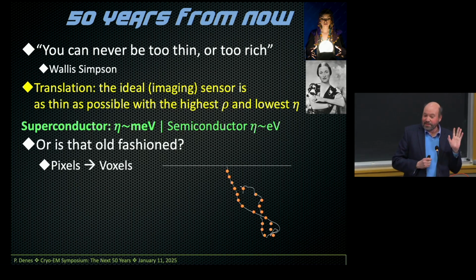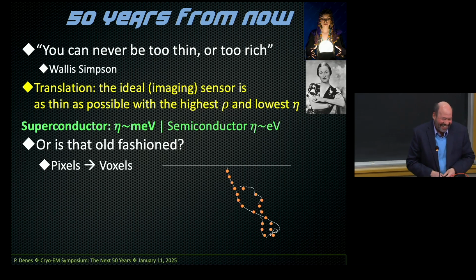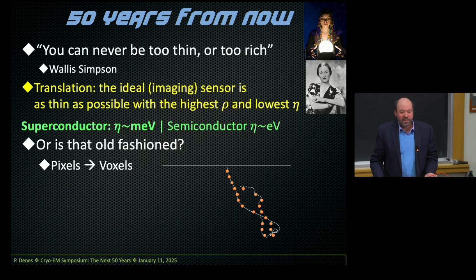Now, I'll just make the note that the one thing that I will have to hand our X-ray friends, even though you did send them kind of down into the ditch, is that they're pretty good at getting decent energy resolution, but in principle possible. And for example, what people who make superconducting detectors, their whole argument is energy resolution. 1 eV, okay, we'll talk, but.